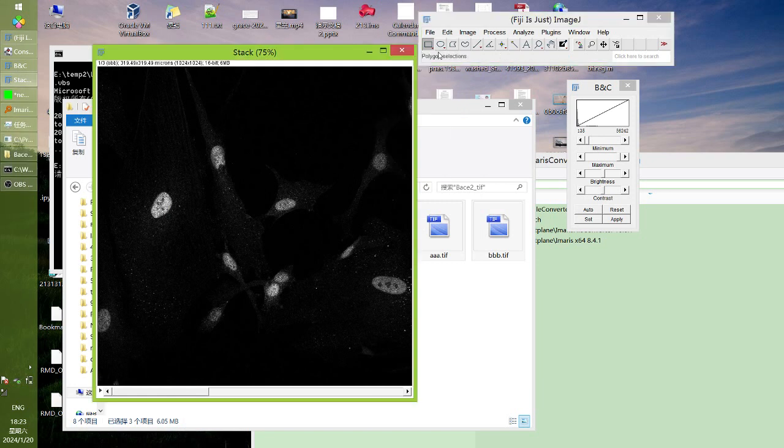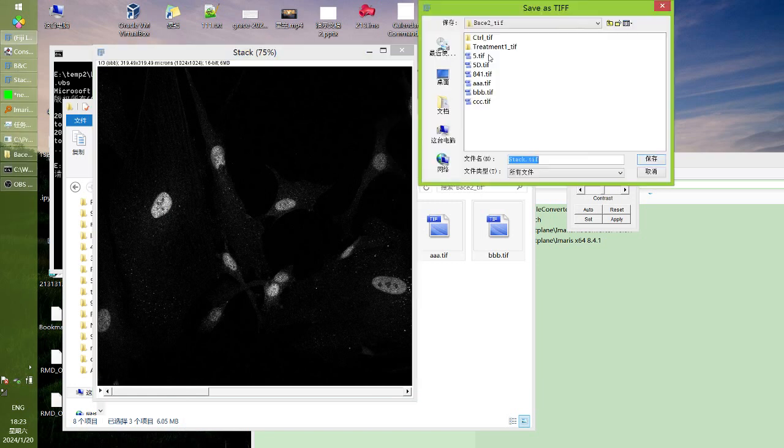And we save. We must save, for all the experiments, the representative image from each experiment. We must save the picked-up images. Base 2 experiment 1 pick up. Save this.